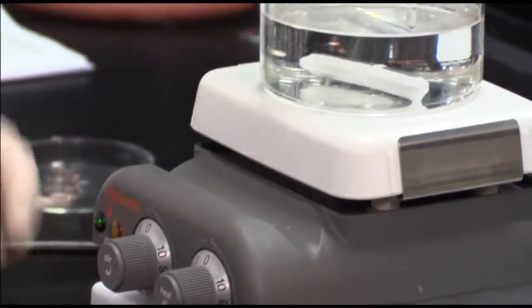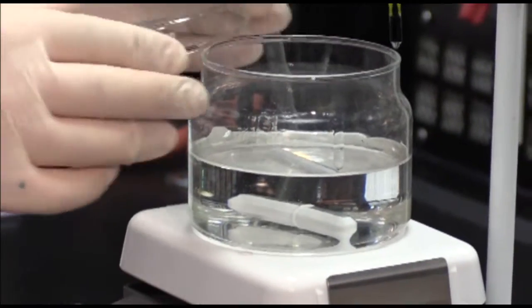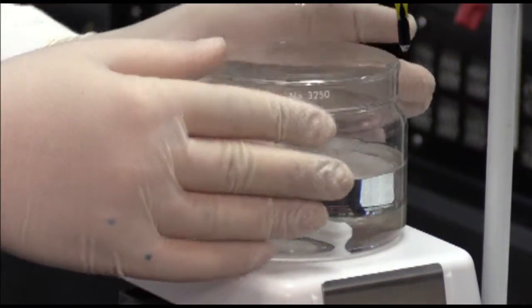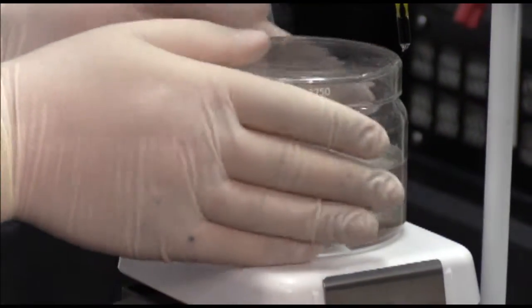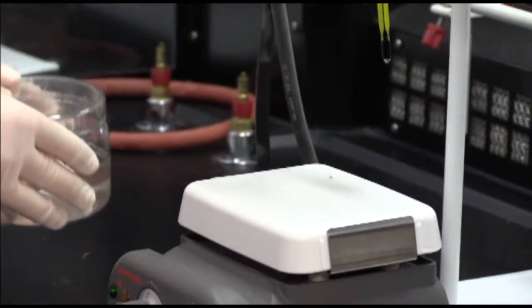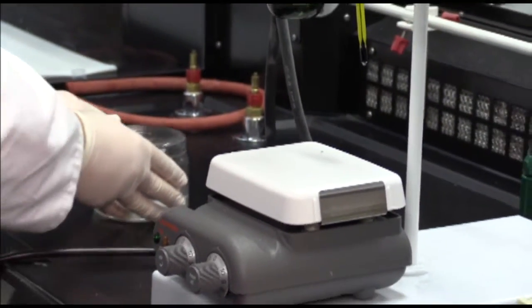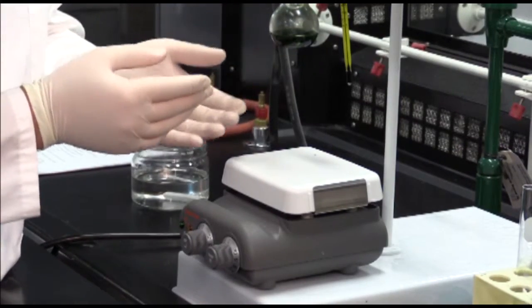Now we can take our lid for our oil bath and place it on top. You can remove your oil bath off to the side, and you're now ready to remove your round bottom flask.